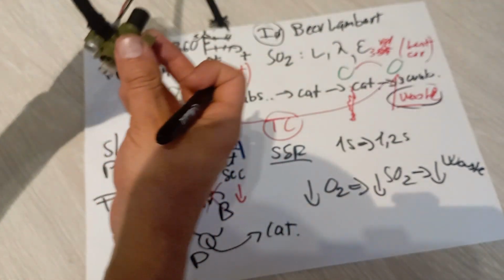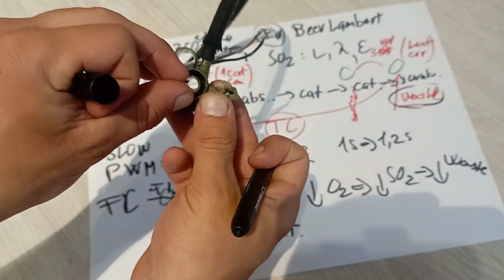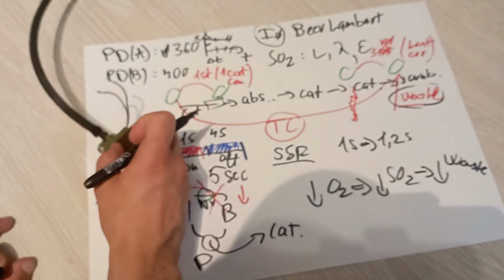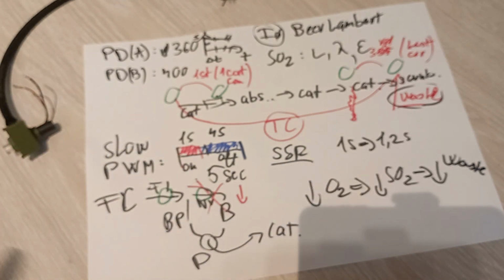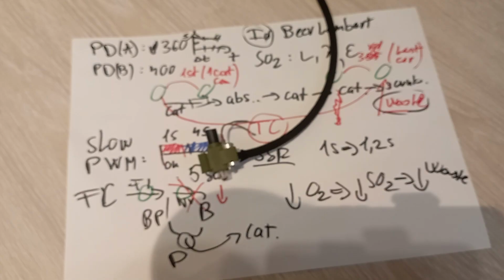So for this, I let the air into here and basically around the pipe here, and it comes out, as well as into the GUVA's little chamber, and it cools the whole system down to a heat that is sustainable by the PLA. That's why it is used like that, and that's the whole total reason.